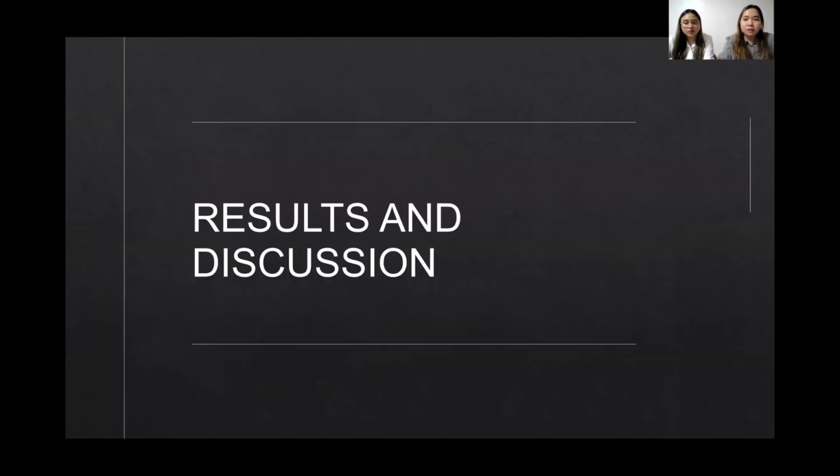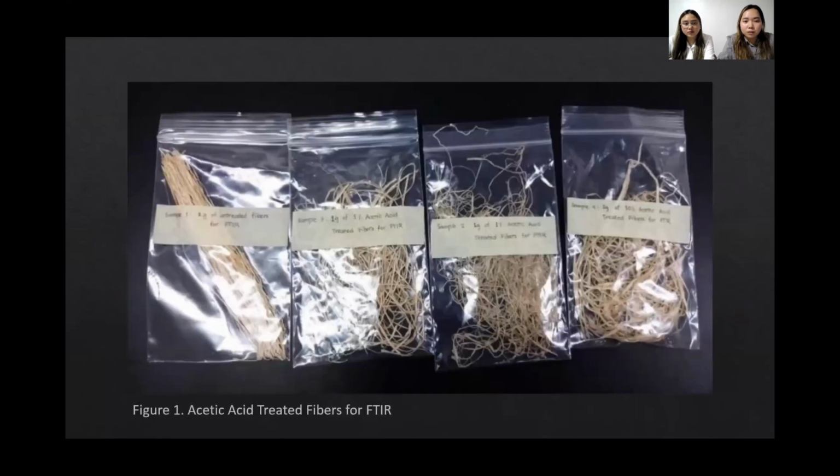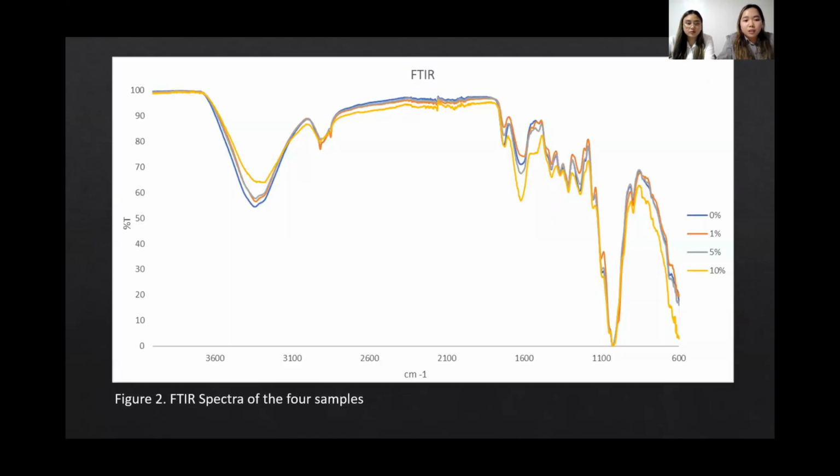We will now proceed to the results and discussion of our thesis. So for the first part, we have the FTIR results, and these are the treated fibers that were submitted to DOST last year. As we can see in figure 2, this is the FTIR spectra of the 4 samples. So for this part, it ranges from 3,287 to 3,339 per centimeter, and it shows the absorption band for intermolecular hydrogen bonding. And we can see as the concentration increased, there is a decrease in peak in this area. The amount of hydroxyl groups decreased, which indicates that the treatment had successfully removed the hemicellulose and lignin content of the fiber.